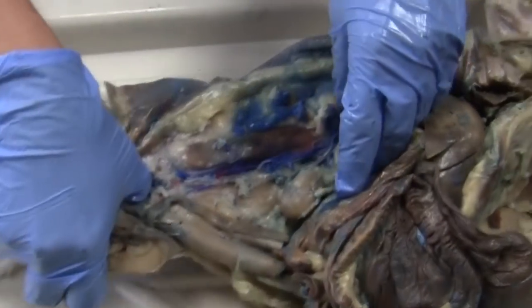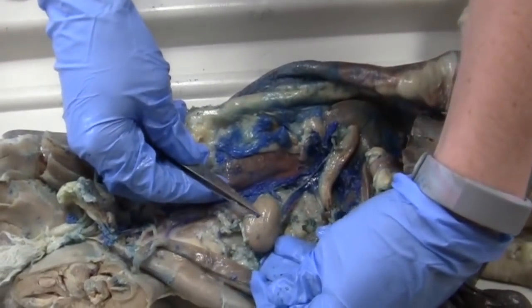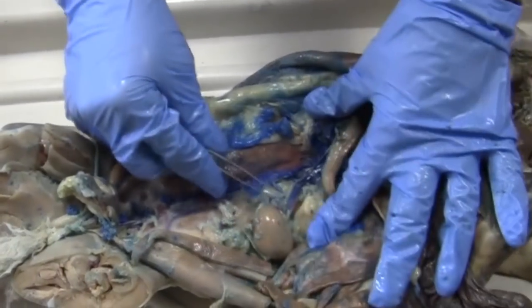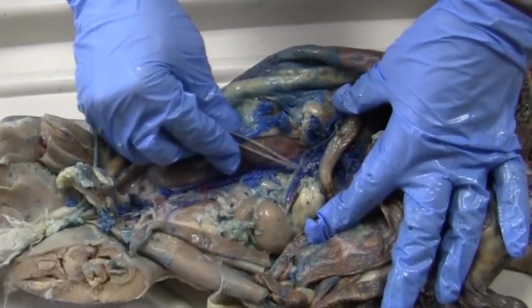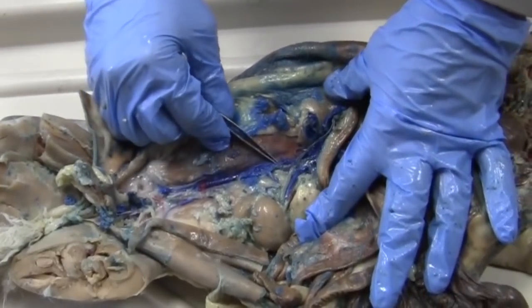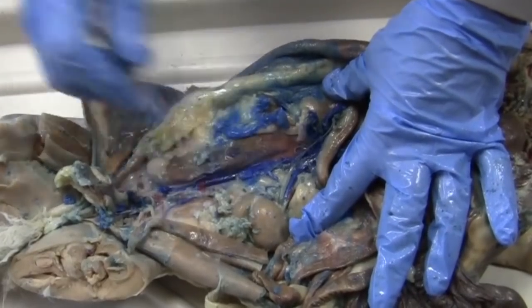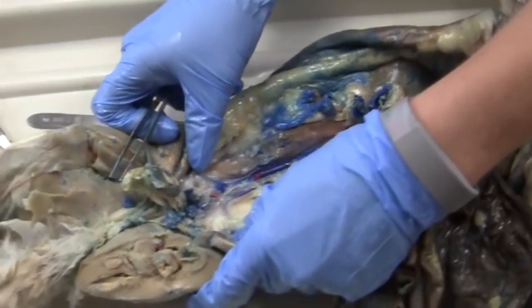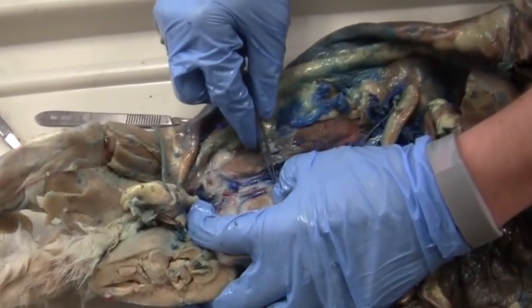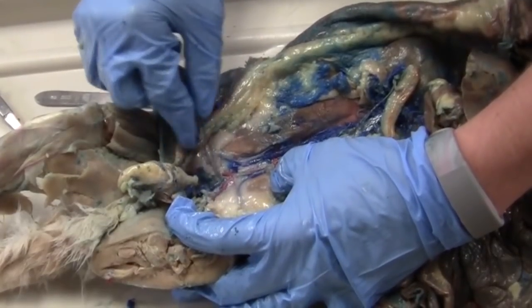So also, when we're down here, we have the renal artery and vein as well. Renal meaning kidney. So artery and vein are coming off of that kidney into the caudal vena cava, or blood coming from the aorta to the kidney. So as I move down here to the bottom of the animal, you can see that this aorta especially, hopefully you can see that, is branching.